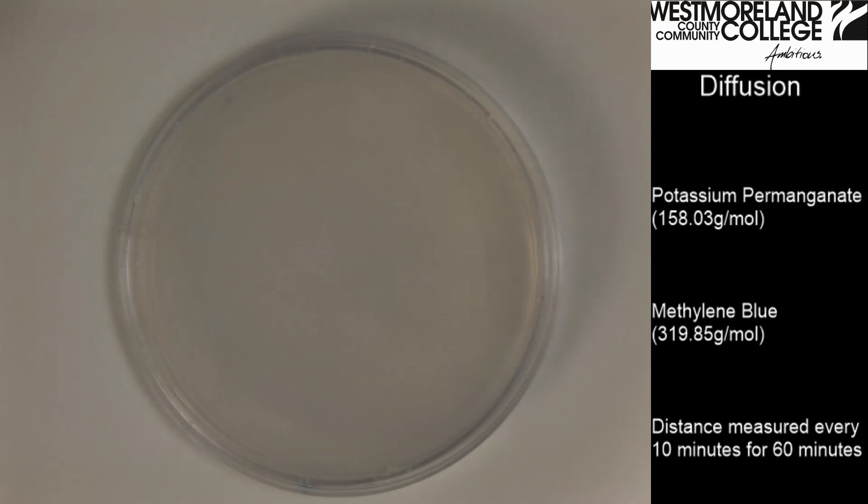This video will perform the diffusion experiment using an agar plate, potassium permanganate, and methylene blue. The distance measured will be every 10 minutes for a total of 60 minutes.